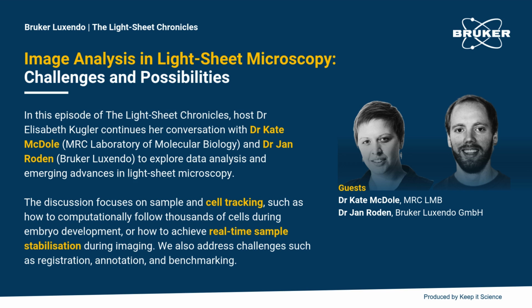So maybe I can start off with asking you, Kate, because in your lab, you work with hundreds and thousands of cells, and obviously that can't be done manually. You have to automate cell tracking, but cell tracking is very complex. So maybe you can introduce how you do cell tracking in the lab.